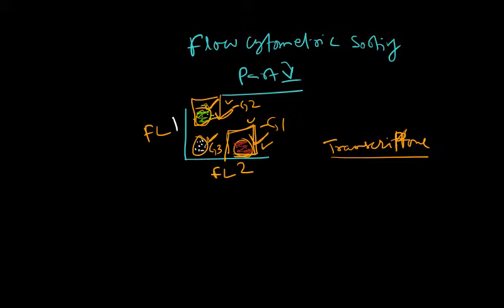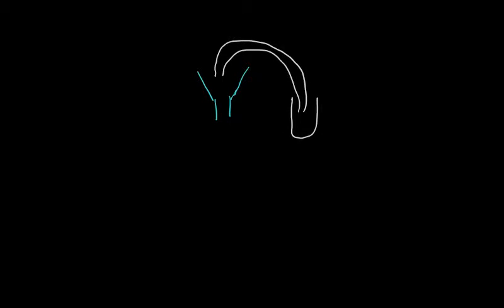We'll talk about that. In order to sort, what is required for the sorter? We'll see a general anatomy of a sorter. If you are talking about a sorter, it is something like this. There is a flow cell, and the sample is injected into the flow cell. Somewhere there is a sample tube, and there are cells in this, and the sample enters the flow cell.